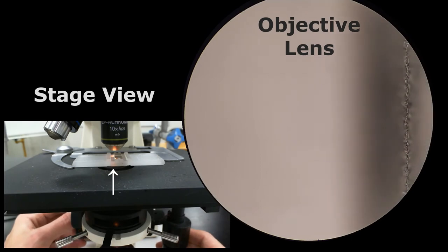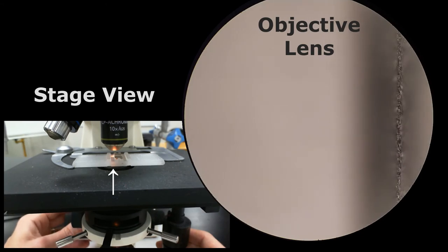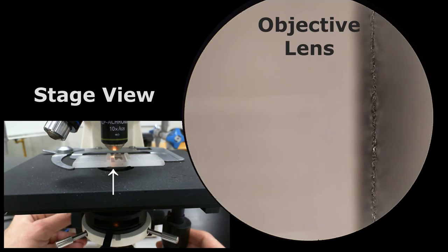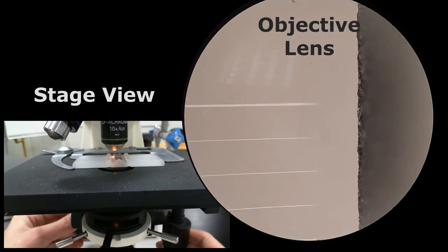What you're looking at is this dark line under the microscope. You can start using the focus to see, okay, I'm going to keep on focusing until I see this ground glass become more of a sharp edge. And that's what I'm seeing here.